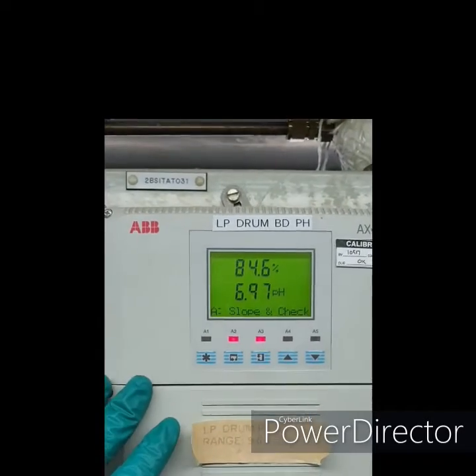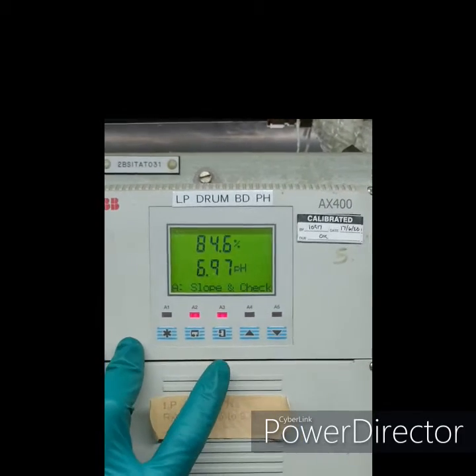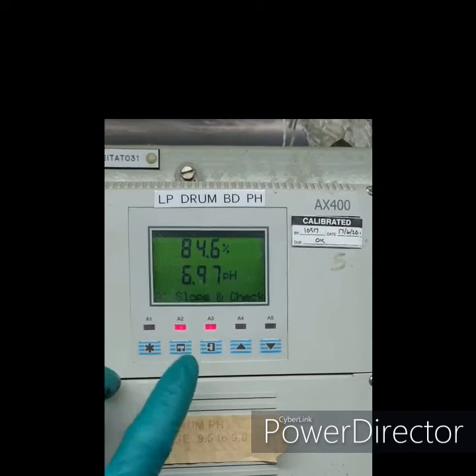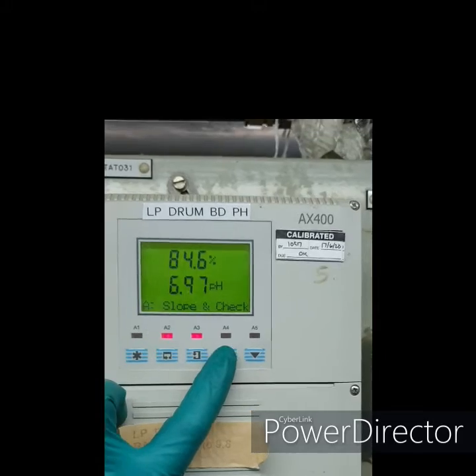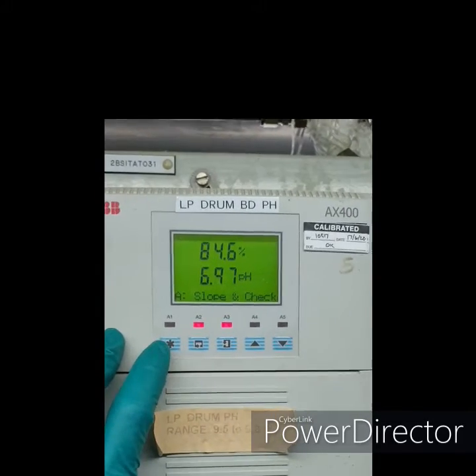Our calibration process is complete, so we'll check the calibration result. The slope is 84.6% at 6.97 pH. We'll go back to the monitoring display.